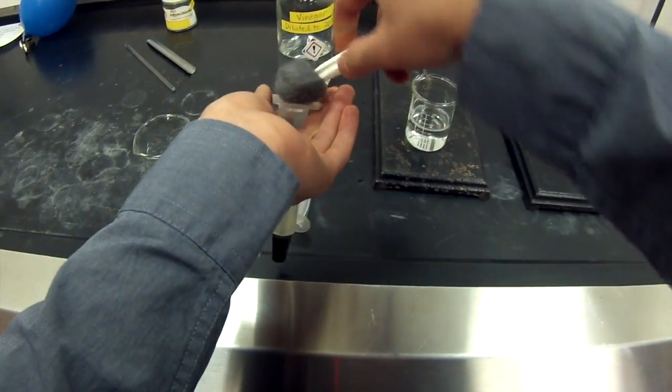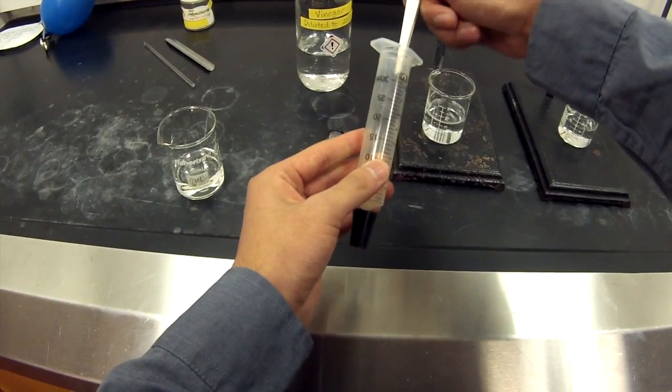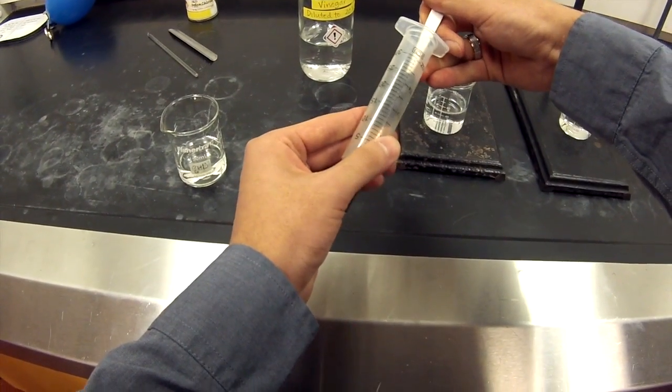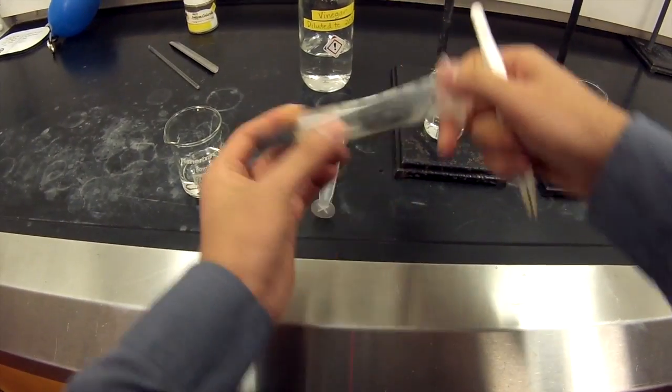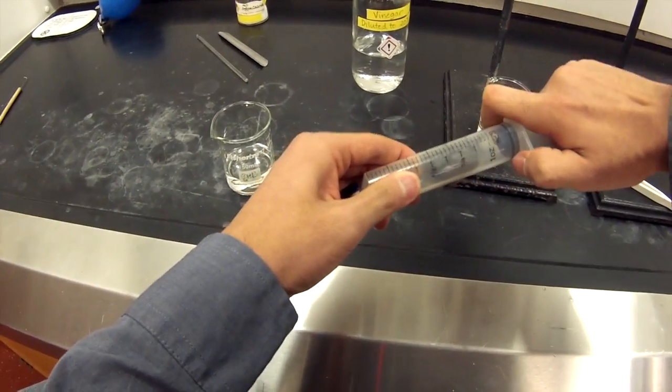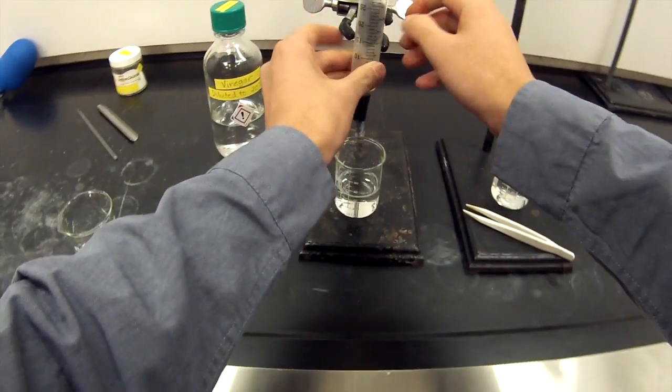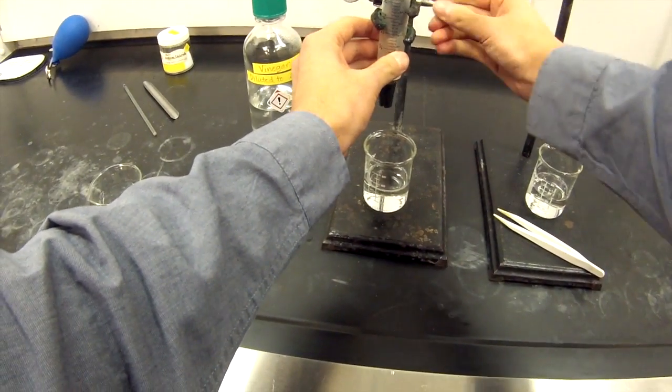Then we're going to take our steel wool and push it down into the syringe between about the 10 milliliter and 30 milliliter mark. Somewhere in between there should be fine. It doesn't have to be exact. And then we're going to take the tip of our plunger and insert that back into the main body and push it down to about the 28.5 or 28 milliliter mark. Again, it doesn't have to be exact.